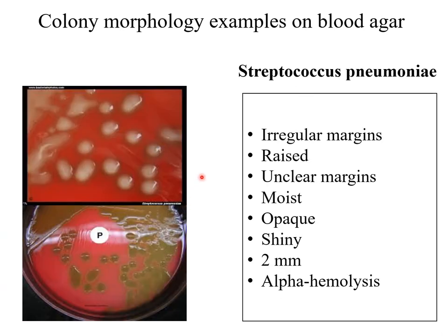Streptococcus pneumoniae: the colonies have irregular margins, are raised with unclear margins, moist, opaque, and shiny. They are usually 1 to 2 mm in diameter, and are characterized by being partially hemolytic on blood agar — the pattern is alpha hemolysis — which can be seen by the greenish discoloration of the blood agar.